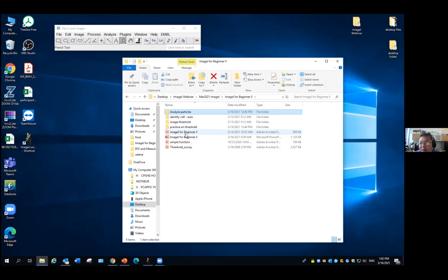So today we're talking about, probably you are more interested if you can ask the program to do this automatically. That you have an image, each image has like 100 cells. You don't want to manually draw 100 cells. And more than that, you may actually have 20 images like this for one condition. For another condition, you have another 30 images. You definitely don't want to draw them one by one. Okay?